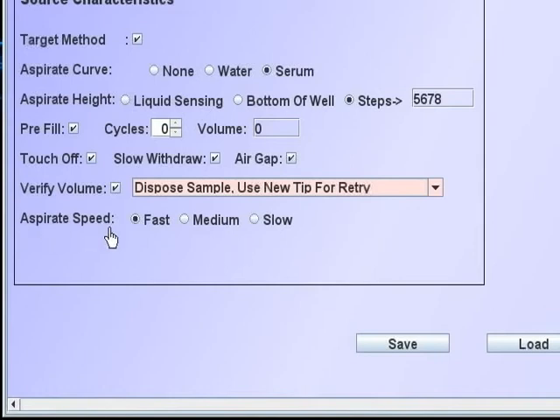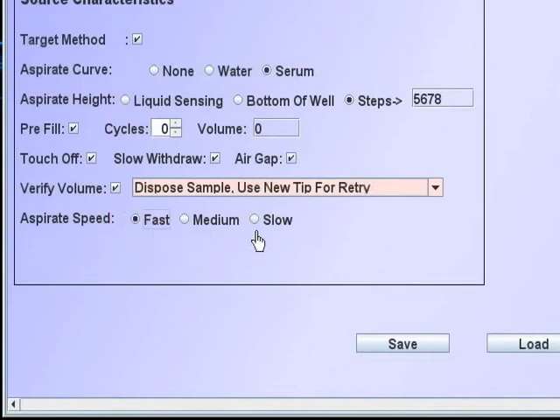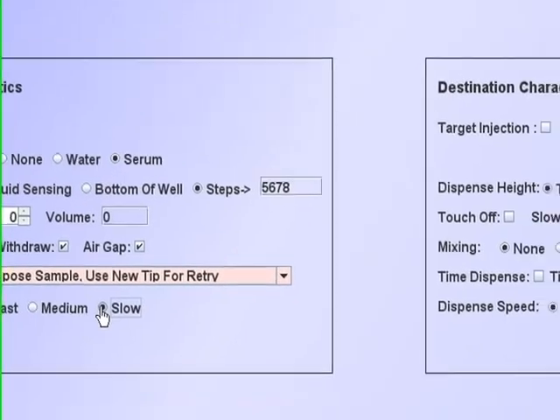Aspirate speed is self-explanatory. Aqueous fluids may be aspirated at fast speed. Plasma and serum should be aspirated at slow speeds. The aspirated fluid must be able to follow the piston motion.